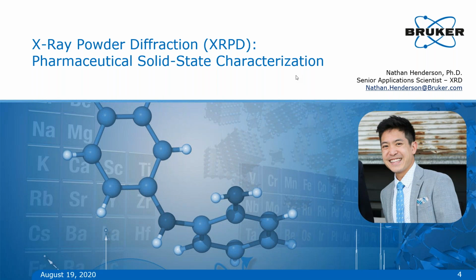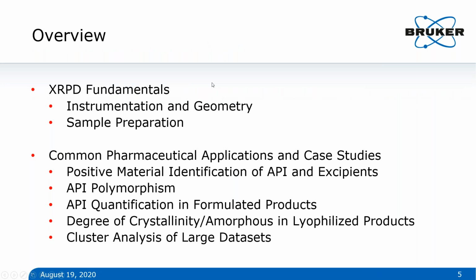So throughout the next 45 minutes or so, we're going to go through a little bit of information about what is powder diffraction, and some targeted examples about what types of studies are currently being done within the pharmaceutical industry. Okay, so we'll start out very briefly with some fundamentals. Powder diffraction is something that I was very fortunate in that I got to do this a lot throughout my education, but it's not necessarily quite as abundant as, say, chromatography or spectroscopy techniques.